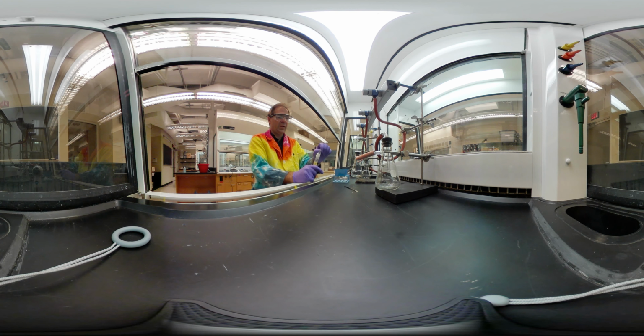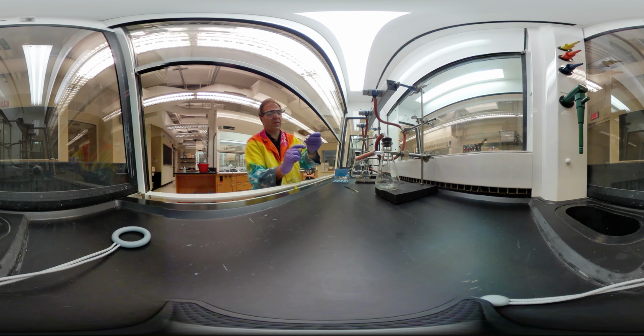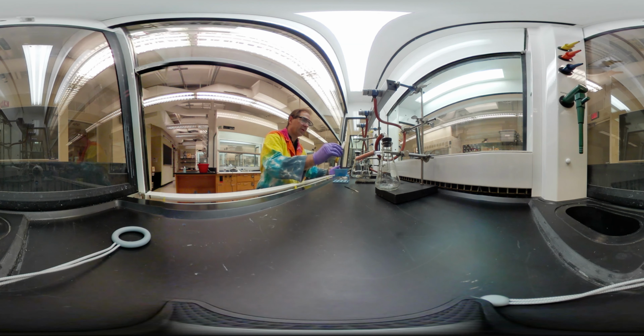Right. I may have a little trouble getting stuff transferred because it's been settling all night. This is the wax coating there. If we don't get it all to transfer, that's okay. But we do want most of it if we can. Woo! Sneaky chemistry. So I ruined the hood. Okay, it's getting pretty thick now.